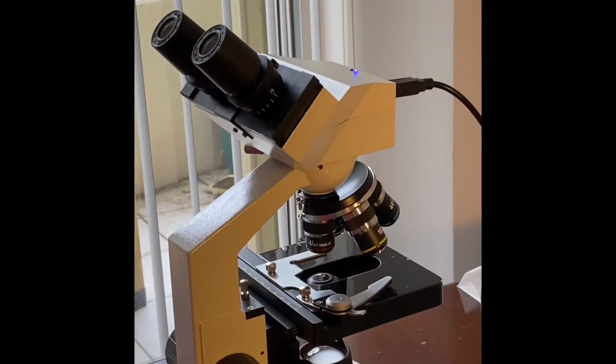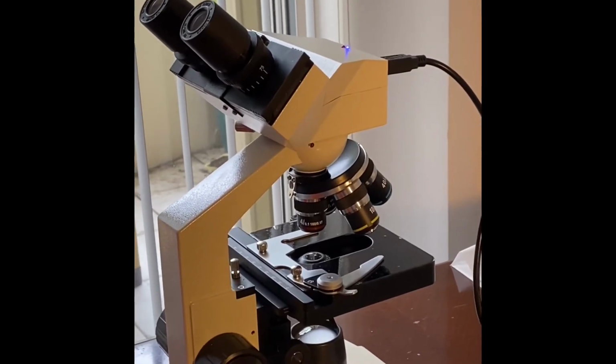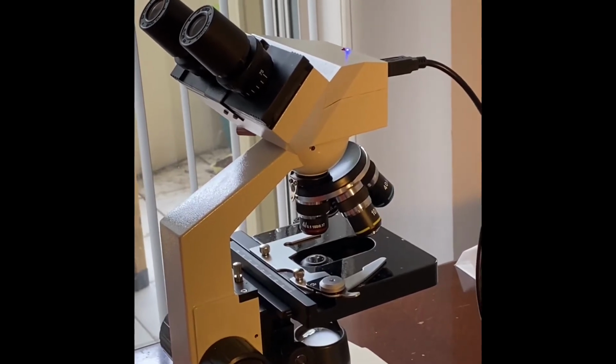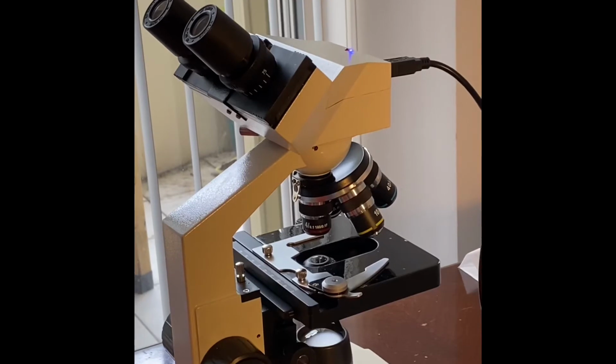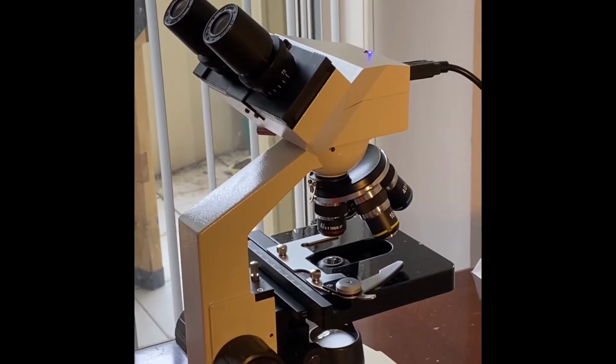You need to think about your use over the years and what reasons why you may need a new monocular microscope versus a binocular. It could be an economical reason.